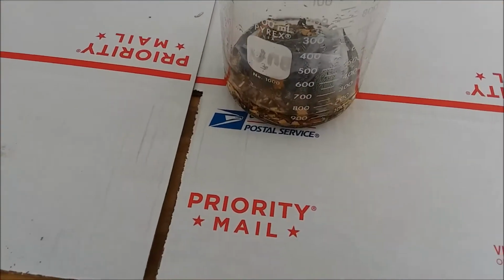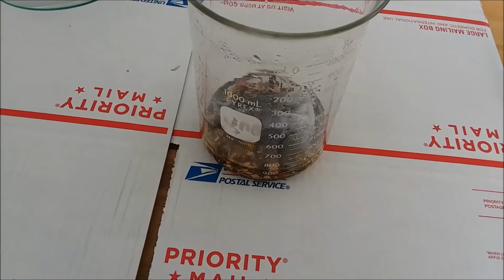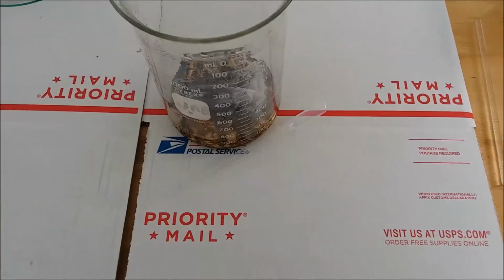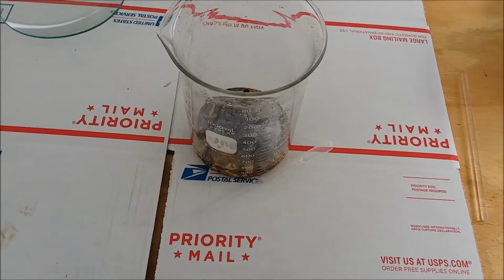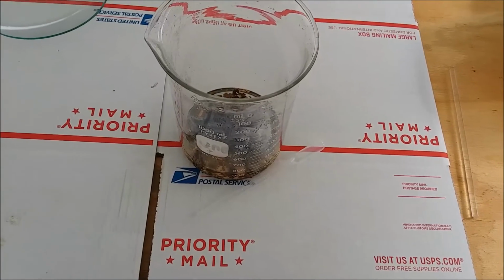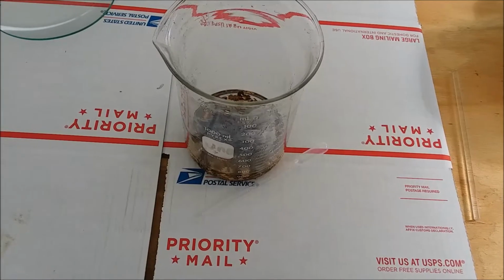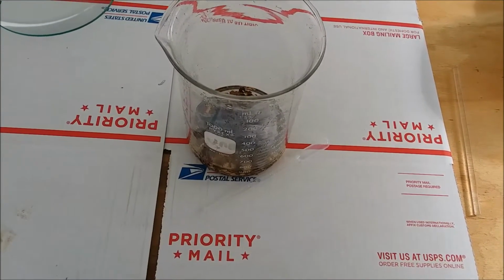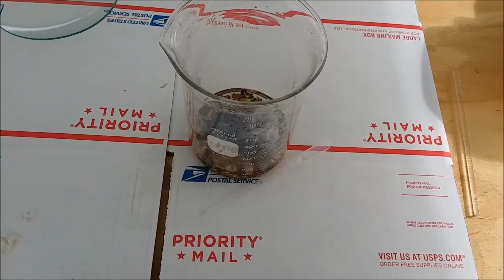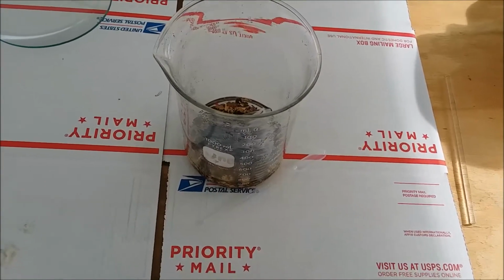I'm going to add about 150 milliliters of muriatic acid to this, and not nearly as much bleach as I put in before. Just a few pipettes full, and see how that does. If the gold isn't dissolving well, I'll add a little more. But I'm not going to put in tons like I did last time, because then there was a lot of chlorine gas dissolved in liquid, and it just didn't go well. So I'm just going to use as much as necessary to get it dissolved.